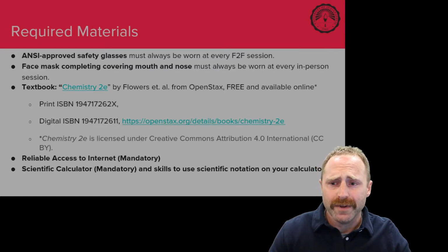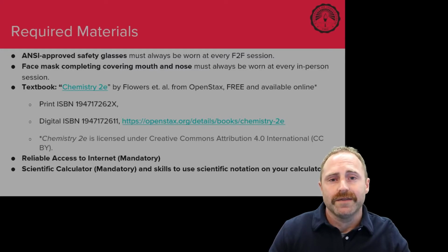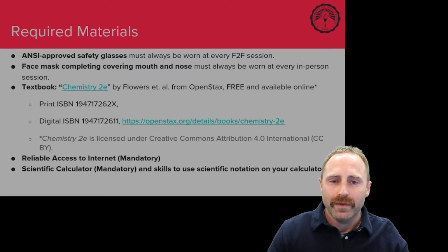Let's talk about required materials. You must wear and provide your own safety glasses to every face-to-face laboratory assignment. Every face-to-face laboratory session, that's what the F2F stands for. You have to provide your safety glasses. There's a variety of places that you can get them: the bookstore, Amazon, Lowe's, Home Depot, other places that also have not paid us for advertisement. But you are required to get those safety glasses.